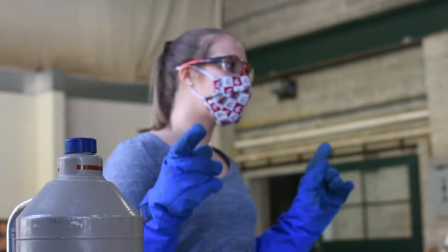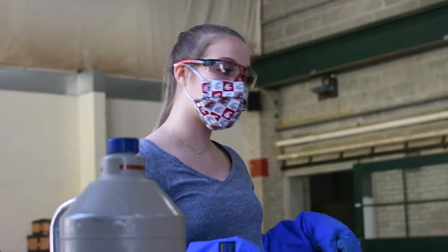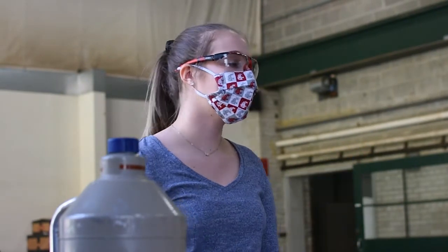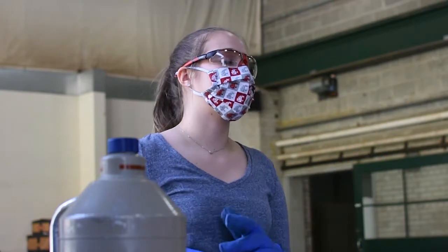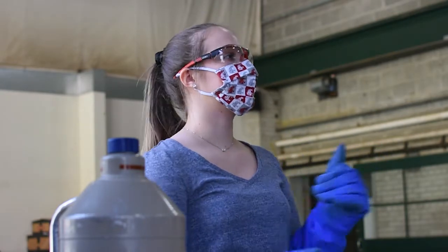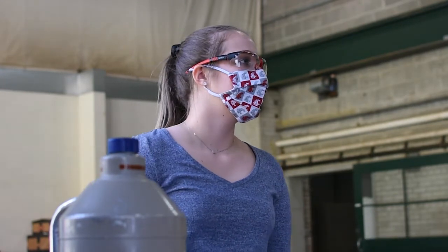All right, so key takeaway from our first B, burns. Remember to never wear clothing or shoes that can catch the liquid nitrogen. And remember to always be careful where you're using liquid nitrogen so that the liquid air doesn't come into contact with it. Lauren, talk about the gloves that you're wearing.